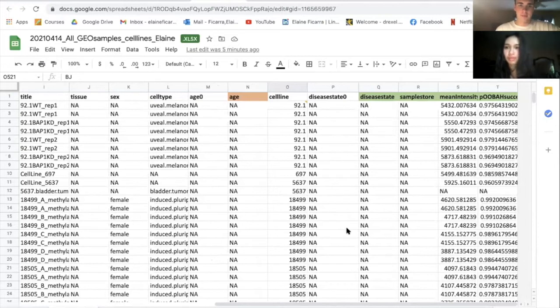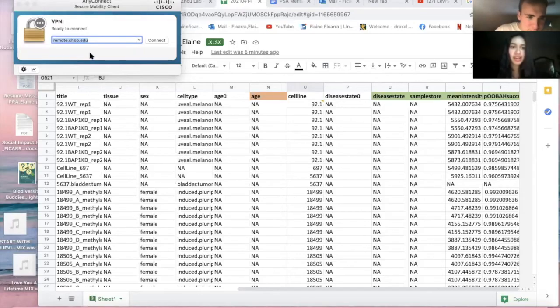Okay. Should I do this? I will show you how to do all of this in code. Oh, nice. Should I connect to this? I can't see what you're pointing at, but I would assume. There's a lot of stuff on my desktop right now, so just ignore that.